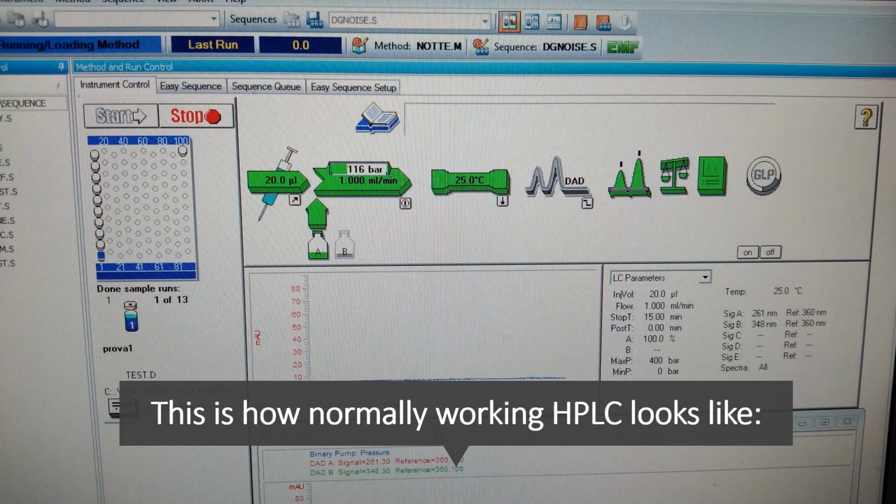So 1 of 13 means that in total there are 13 samples, and the machine is at the moment working on sample number 1. But I can only see 10 samples and one at the 100 position, which is probably our night mode sample. So it's like 11 samples. How come it's 13? There could be two possibilities. The researcher saved vial 1 three times, like in the sequence bar you say vial 1, vial 1, vial 1. You give the command to take the sample from vial 1 three times, probably because you want three replicates of sample number 1. Or you do vial 1 two times and vial 2 two times, so you end up having replicates of vial 1 and vial 2. That's how it becomes 13 samples.